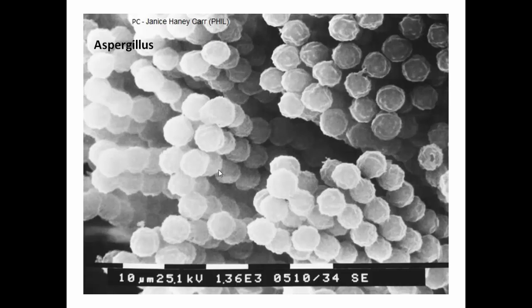This amazing electron microscopy image is of Aspergillus. You can see how beautiful their arrangement is — like a stack of buildings. This is the electron microscope image of Aspergillus. Something clinically relevant: it is found in plants and decaying plant matter, and it can be found in soil.